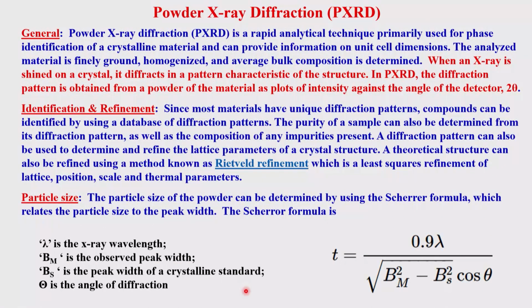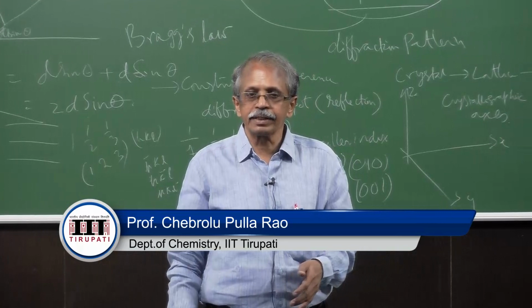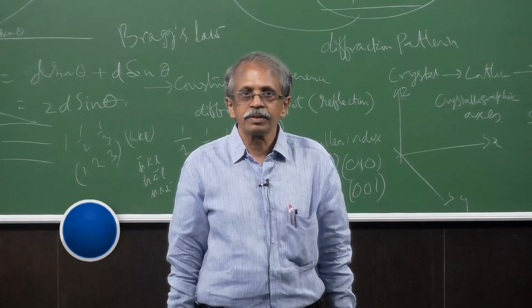Using these things you can always make the estimate. We will come to more details of this, how we can use the powder pattern to get the structure, the phase of the crystal, the purity, all of those things. As we keep going, we will translate those parameters. So we will look at those aspects in the coming class. Thank you very much.